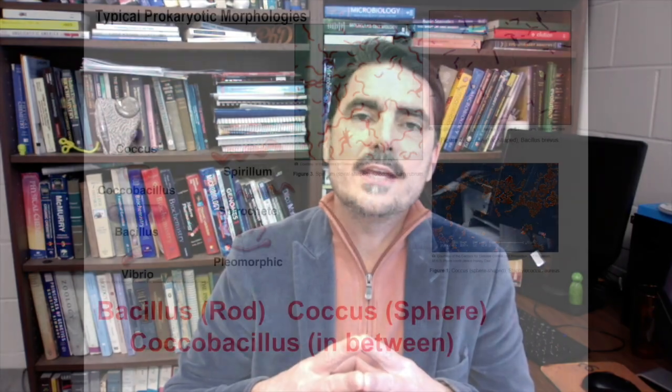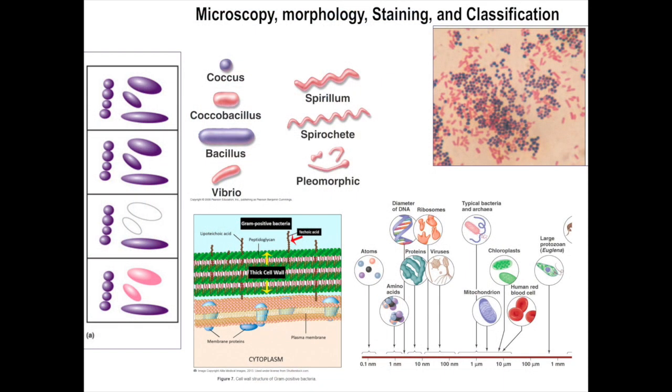You all have microscopes, and so when you're using it, you should have just some fundamental concepts of how it's actually working. We will talk about how we take information from gram staining and cell morphology, as well as other biochemical and physiological tests of bacteria, as a way to identify the bacterium. So this is important in clinical laboratory science to be able to identify, right, the infectious agent that is an infection. So let's go ahead and take a look at these slides.